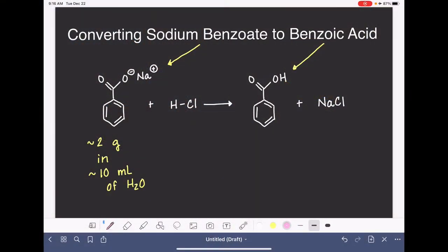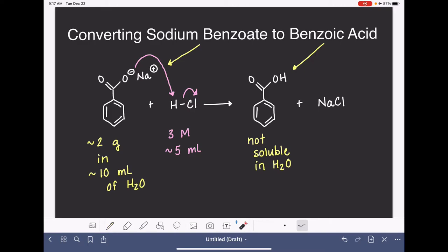Once all the sodium benzoate has dissolved in water, we're going to add some hydrochloric acid — it's a pretty dilute concentration, 3 molar — and we're going to be adding about 5 milliliters or however much it takes. When we add the hydrochloric acid, it is going to protonate the negatively charged oxygen on the sodium benzoate, converting the sodium benzoate to benzoic acid. Even though benzoic acid is polar, it is not soluble in water, so we will be able to see it form as a solid.